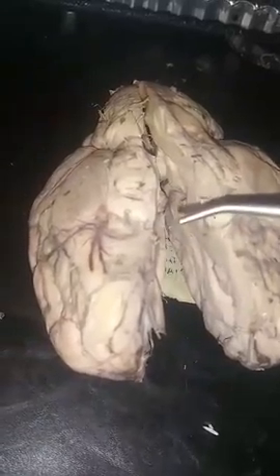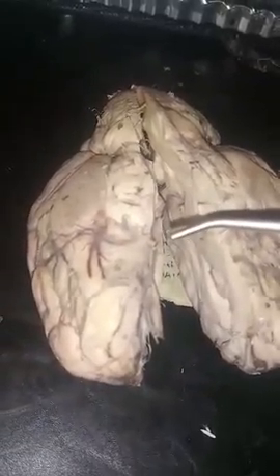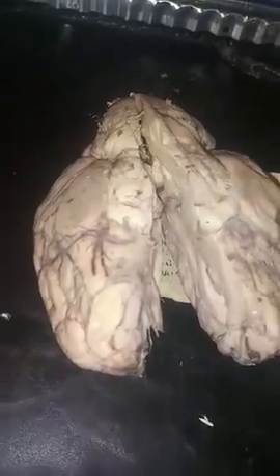Right here is the cerebellum, which is the part of the brain that controls balance and muscle coordination, and it is located inferior to the cerebrum. The olfactory bulbs are located back here. Those contain cell bodies of neurons that synapse with neurons of the olfactory nerves. Right here is the optic chiasm, which is a crossing point of the optic nerve.